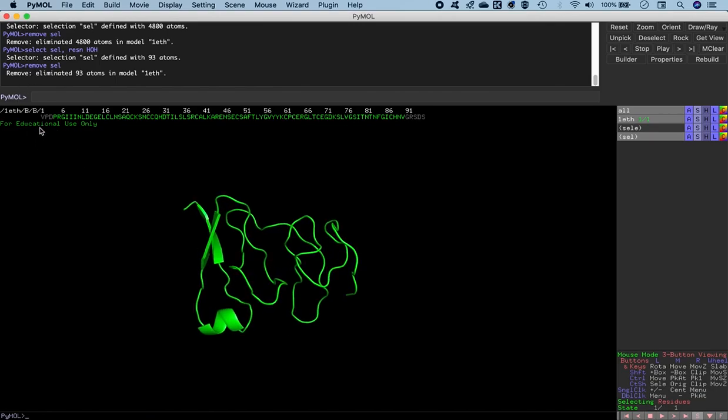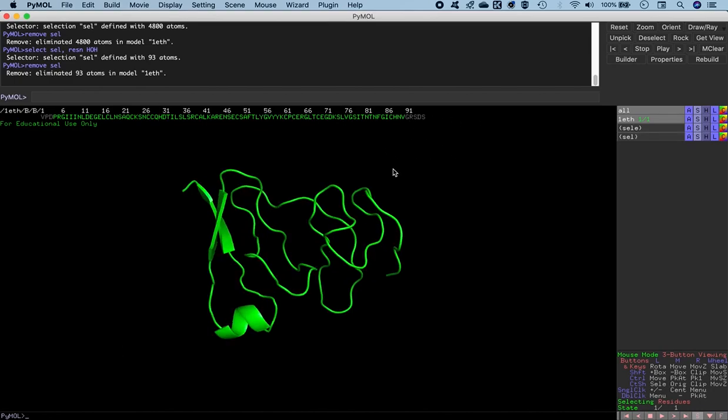Now we are going to model the N-terminal missing residues and the C-terminal missing residues. So extreme start of the structure and the end of the structures. But before we use the builder tool out here to reconstruct these residue regions, we'll basically annotate the N and the C terminal, that is the existing N and the C terminal, which is proline in the N terminal and valine in the C terminal, in a more acceptable representation, let's say a licorice representation.